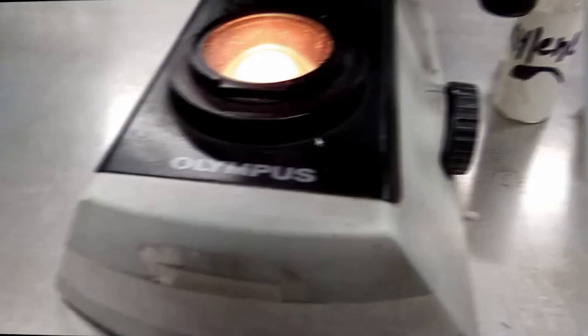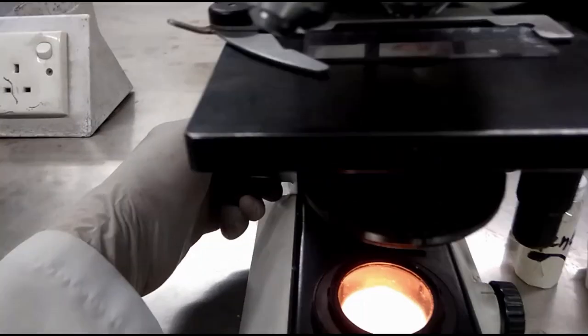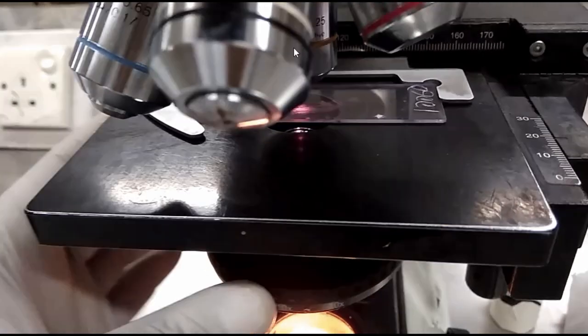So coarse and fine focusing adjustments. The coarse adjustment is required when focusing the specimen. So here you can see, this large one, the coarse adjustment, is required when focusing the specimens with the low power objective. It is carried out by rapid and relatively large movement of the stage which contains the specimen. Yes, this is the coarse adjustment and this small one is the fine adjustment. Coarse adjustment is only used for 10x.